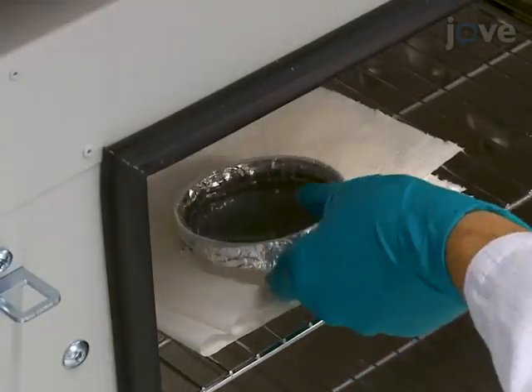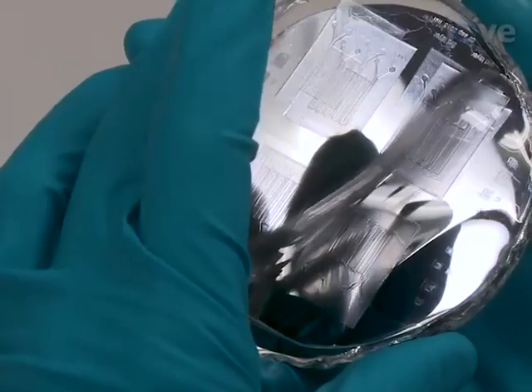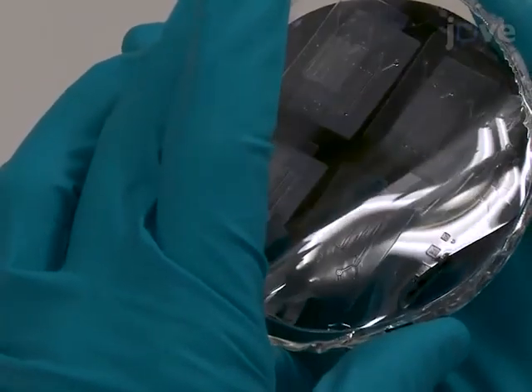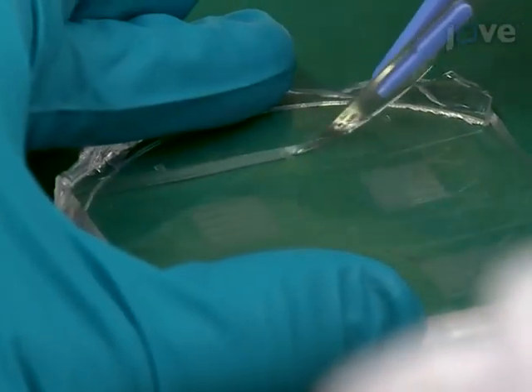Cure the PDMS in an oven at 70 degrees Celsius for 1 hour. Then gently peel the cured PDMS mold from the master. Use a scalpel to cut away the excess PDMS.